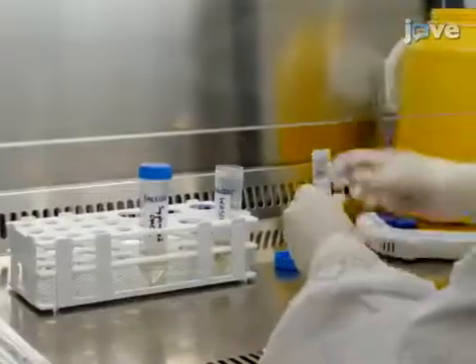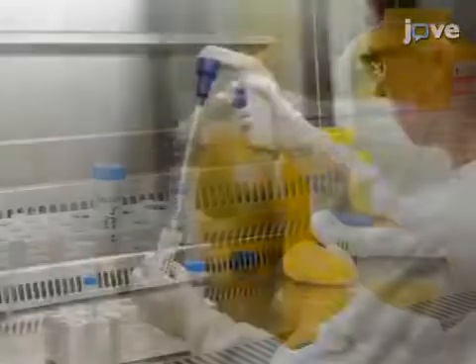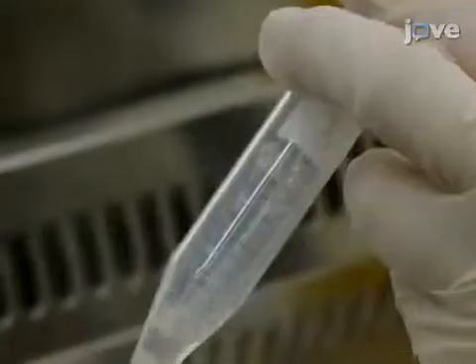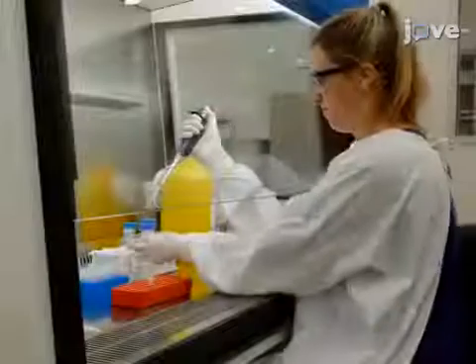After five minutes, carefully aspirate and dispose of the supernatant. Afterward, resuspend the cell pellet in five milliliters of fresh supplemented DMEM. To perform a cell count, dilute 100 microliters of the cell suspension.